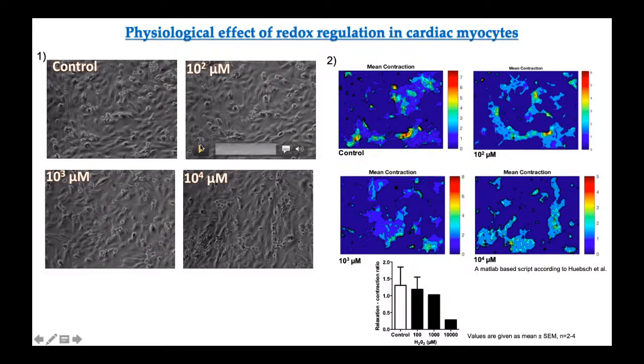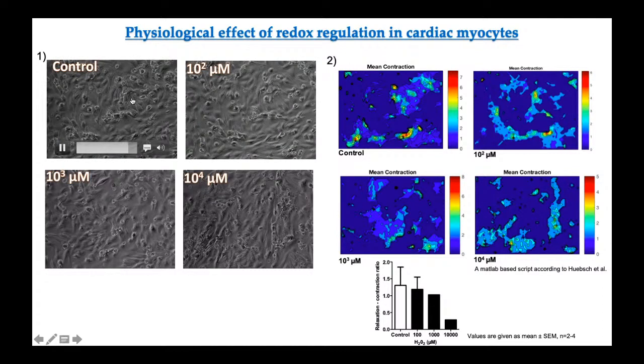Then I want to show you this live cell imaging which was done for 24 hours, and this is what we see. So in the control, cells were fine. In 100 micromolar of H2O2, I want to check the effect of redox on the cells.